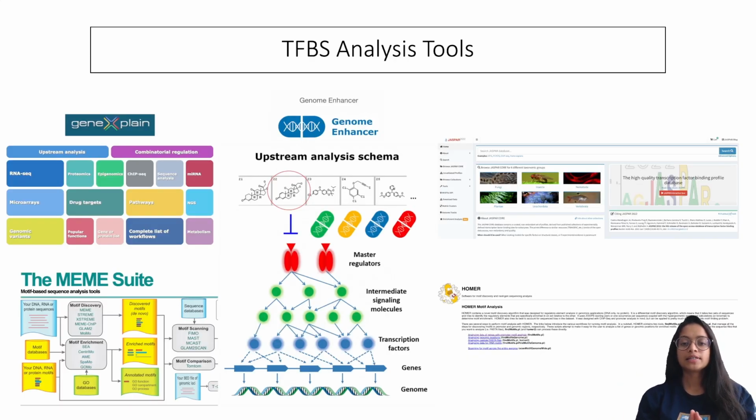So here I am listing several tools and web platforms that are available to perform transcription factor binding site analysis, and these tools use various algorithms and techniques to analyze ChIP sequencing data, DNA sequencing, as well as other experimental data to identify transcription factor binding sites and motifs, and also some related analyses.